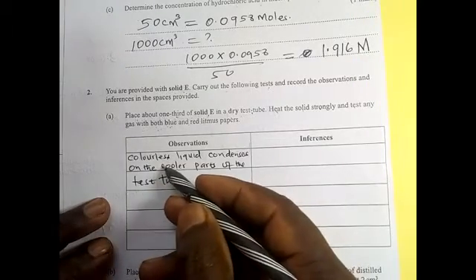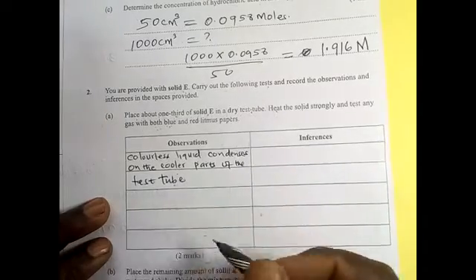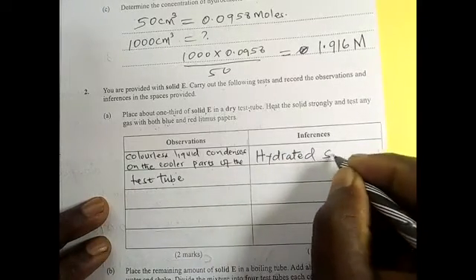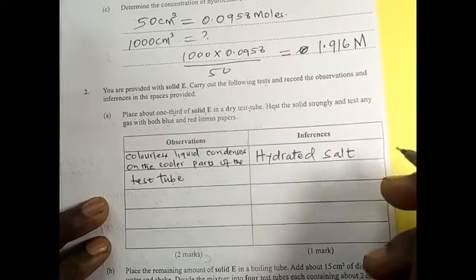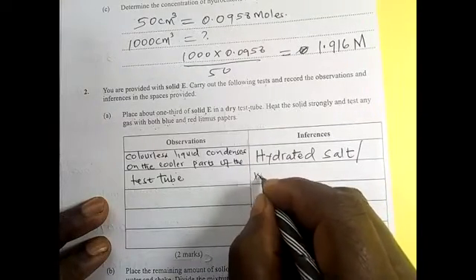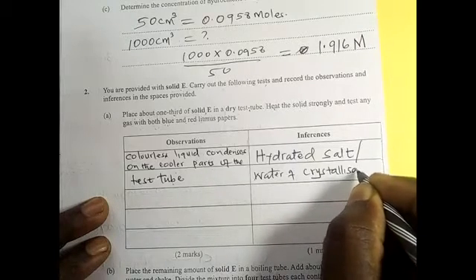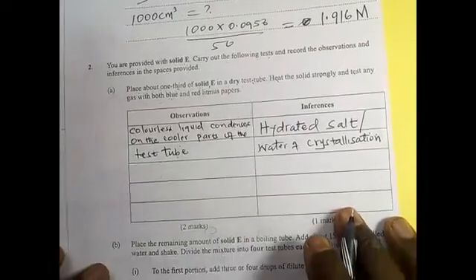So if a colorless liquid condenses on the cooler parts of the test tube, it confirms that there is a hydrated salt. There is a salt which contains water of crystallization. So you can also say water of crystallization. That salt contains water of crystallization.